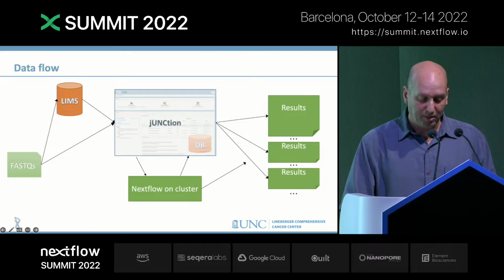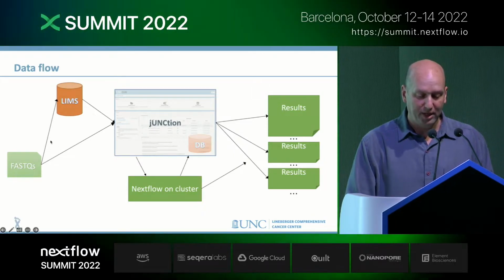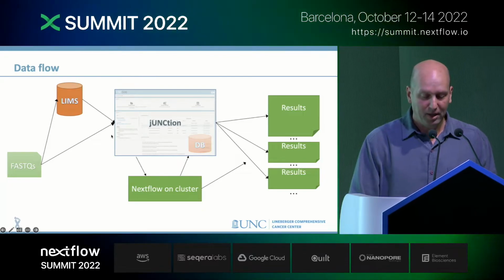So data comes in as FASTQs from the various sources. It gets loaded into our LIMS.